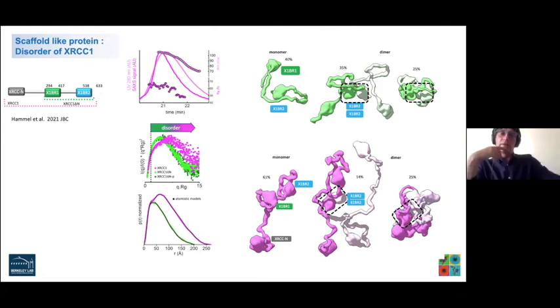Yeah, well, we had a success with Super 6. That's, I would say, try that first. We've been using that one, and then we also have another column that we've been using. I have to check with my tech who's been doing it, but it's more of an HPLC column that we've cobbled onto our FPLCs.